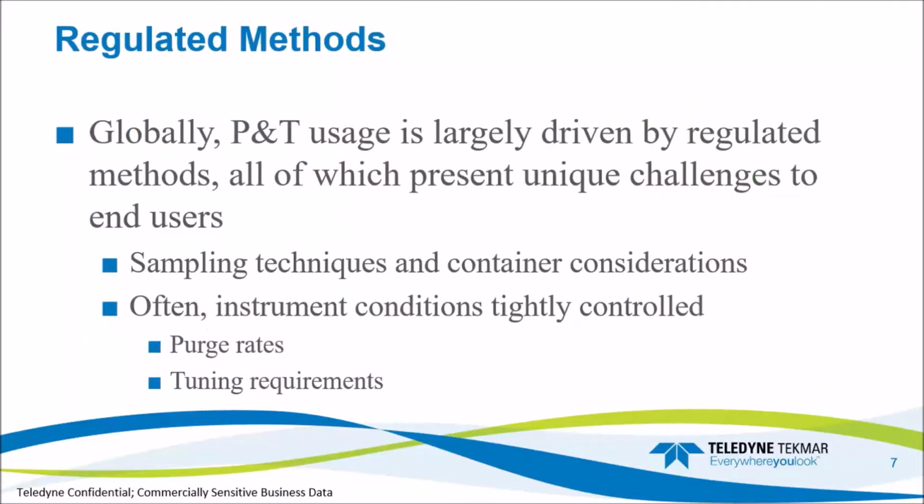For most of our customers, these methods are regulated by governing bodies, whether at the federal or the state government level. All of these methods cover sample collection, preservation, transportation, analysis, and even data handling. This will include specific instructions or considerations for purge times and flows, tuning requirements in the mass spec, and much, much more.